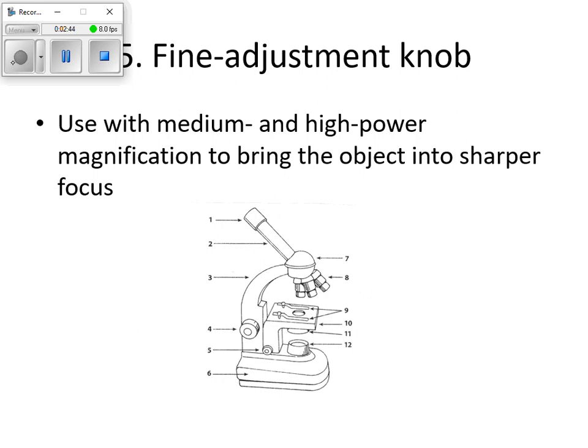I don't really want to do a video of that. But I'm going to give you a little tip as well on what to do there to make sure you don't lose what you're looking at. Because of course, when you start zooming in, if you're not zooming in exactly in the center, even if it's over here a little bit, as you start to zoom in, you're going to miss it, okay? And then you're going to be like, where did it go? I don't see anything. Because you zoomed in on the wrong spot, right? So just keep that in mind, all right?